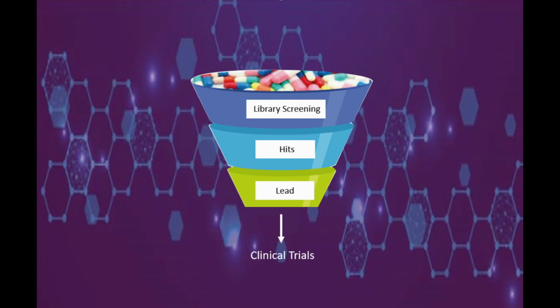In the search for that crucial active or hit compound or biologic that interacts with your target biology, you need to be sure that what you think is a hit is actually a hit. Otherwise, you risk basing your decisions about whether to progress your compounds on inaccurate data. So how do you define a hit?